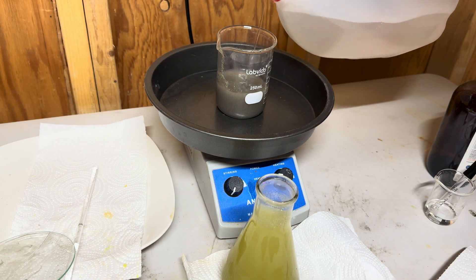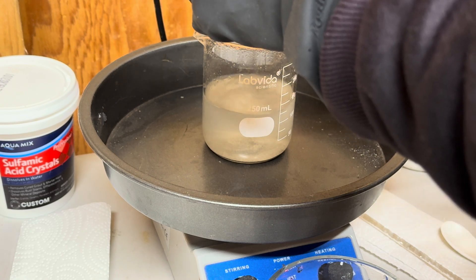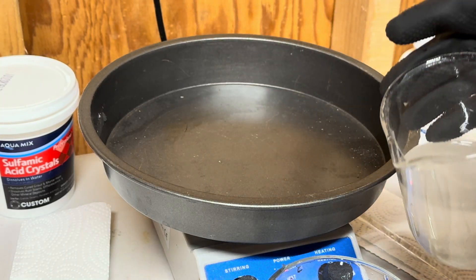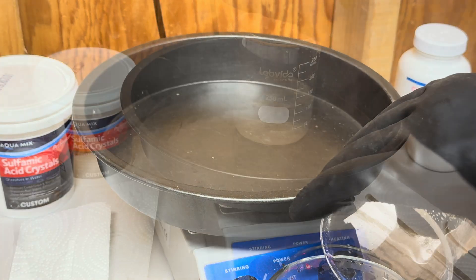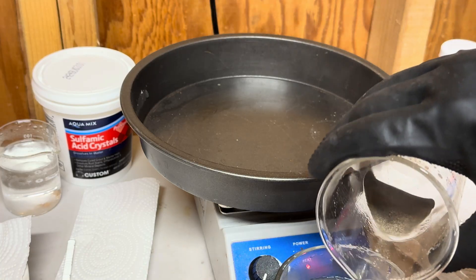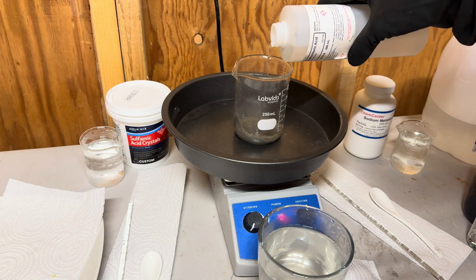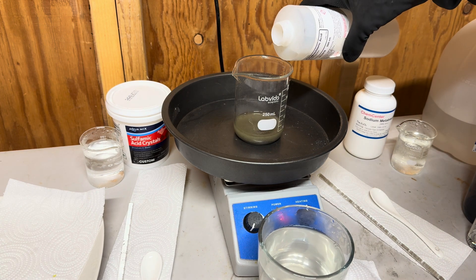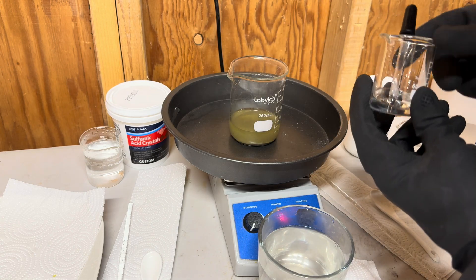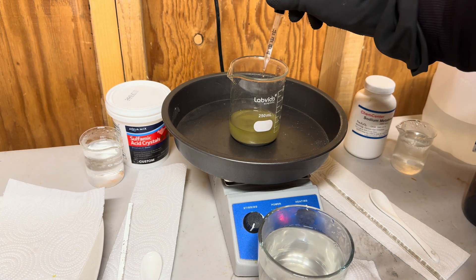Now we will give this a good rinse. This is rinse number two. Now we will make our aqua regia — I'm putting in about 75 milliliters of hydrochloric acid, and now I will add in two milliliters of nitric acid. We will add more nitric acid to the solution should we need it.